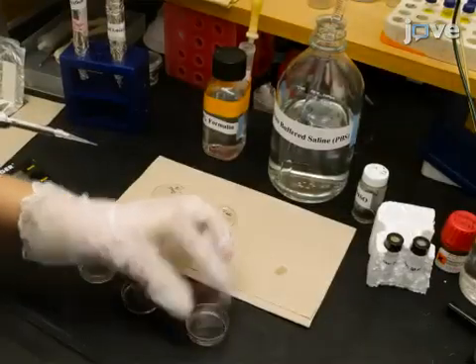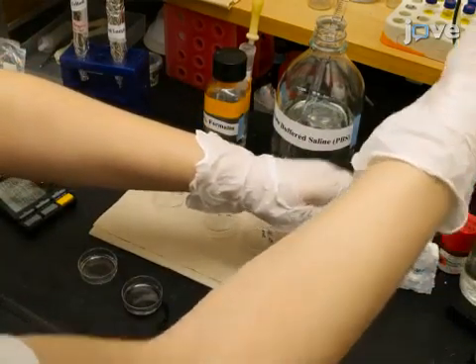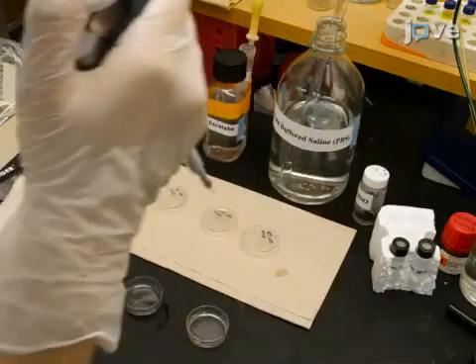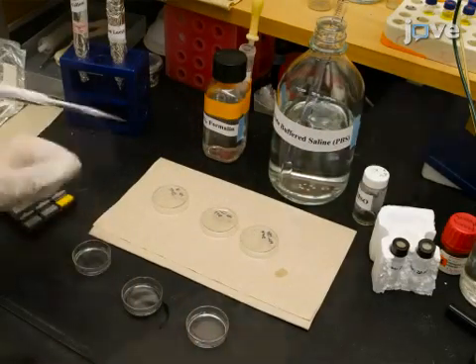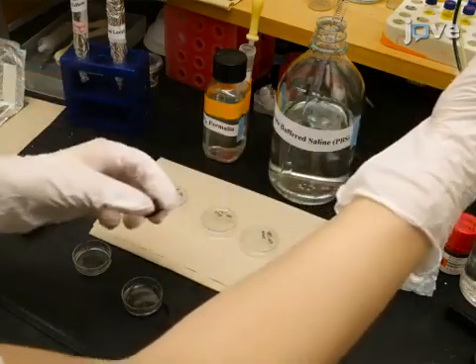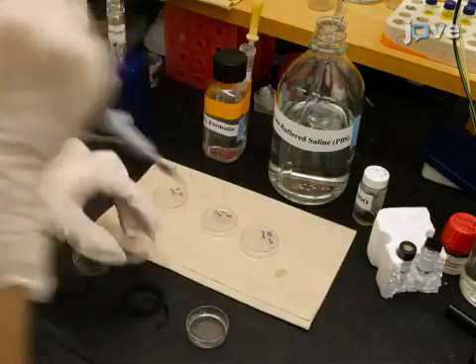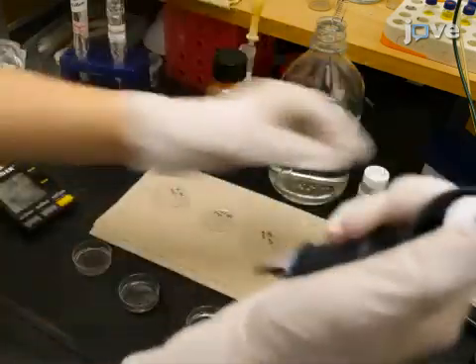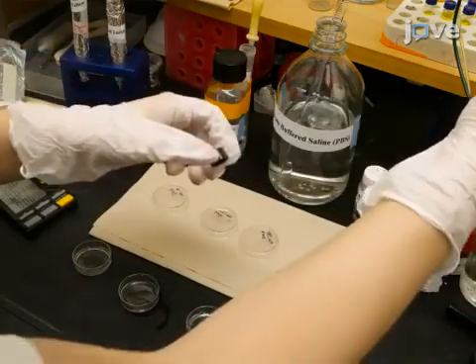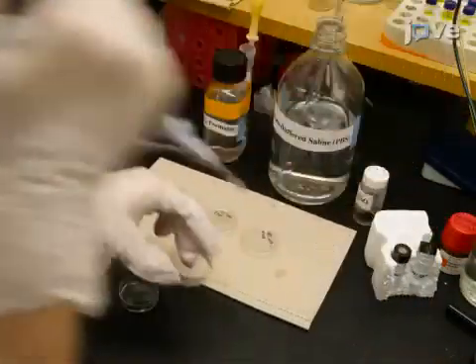To continue with dose-response experiments, add 10 microliters and 20 microliters of a previously prepared 2 millimolar stock solution of phenanthrene in 100% acetonitrile, and 4 microliters, 6 microliters, and 8 microliters of a 20 millimolar stock solution of phenanthrene in 100% acetonitrile to 3 plates of cells containing 2 milliliters of growth medium for each added volume of stock solution.